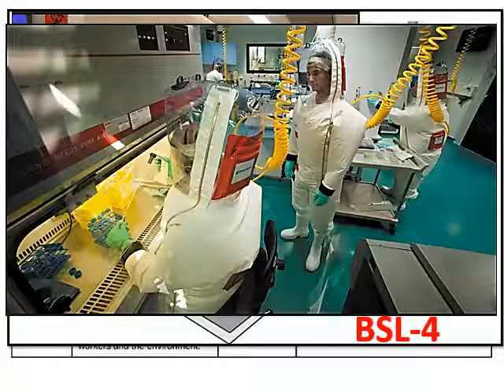Okay, this is a BSL-4 lab, which is similar, except that this time the same safety precautions are applicable. You have to go in through an airlock. You have to take a shower before you go out. But in this case, you're wearing a positive air pressure spacesuit, basically, so that there's negative pressure in the lab so that air will seep into the lab instead of out. And then the air is filtered through a HEPA filter before it goes out. And then you're wearing a positive pressure suit so that air from the lab will not leak into your suit if there's a leak.